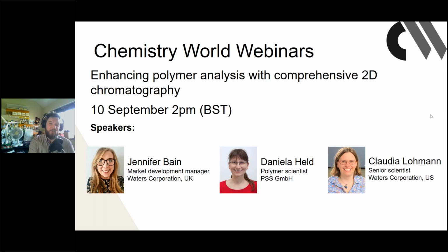And now let me tell you a little bit more about what we've got coming up over the course of the next hour. So once again, enhancing polymer analysis with comprehensive 2D chromatography. By the end of this hour, you will have learned how to increase your sample throughput and the efficiency of your laboratory operations by obtaining accurate and importantly repeatable sample preparation. You will also learn the best ways to leverage comprehensive 2D chromatography to gain additional insight into complex polymer analyses, and you'll learn the most suitable ways that advances in 2D technology can be applied routinely to support your daily polymer innovation needs.